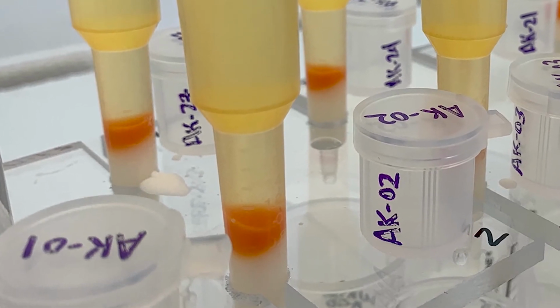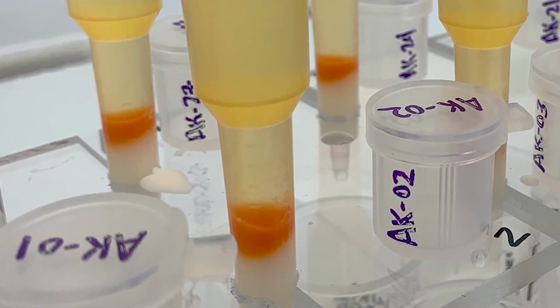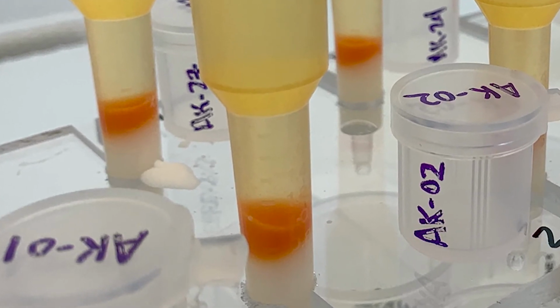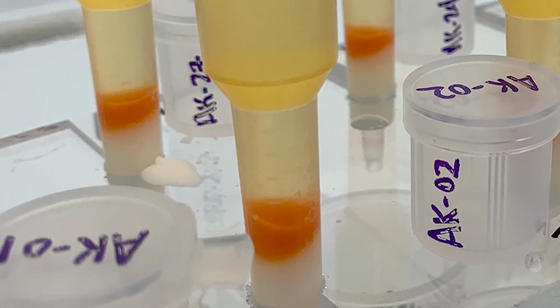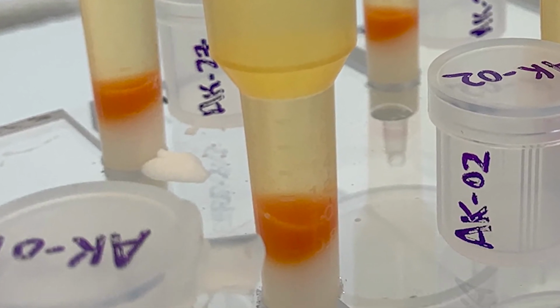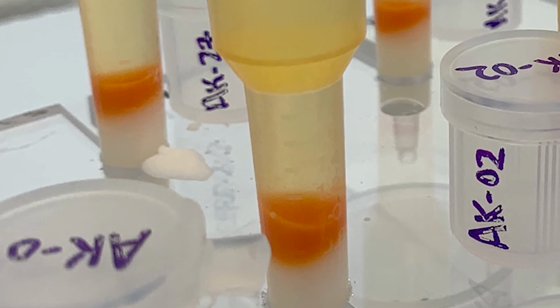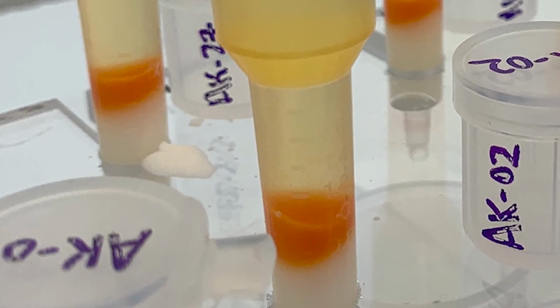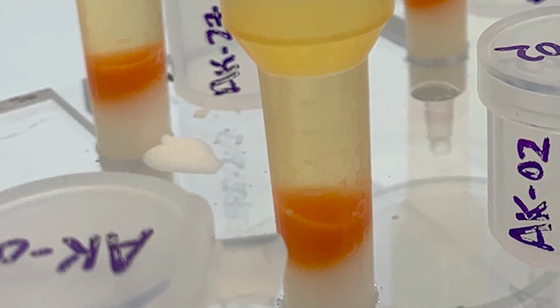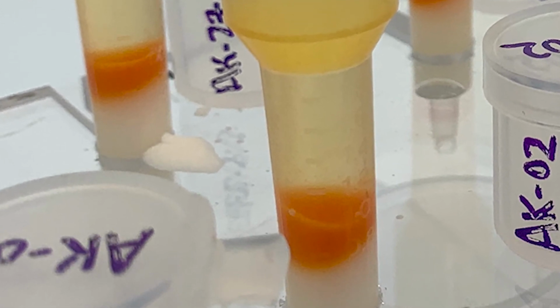And by using a different series of different acids and different concentration solutions, I can actually selectively remove different elements at a time. So I can take a rock that has little bits of almost every element on the periodic table, run it through these columns, and pull out a solution that has just a single element in it. So I've completely purified it. Again, this is really mind-blowing.